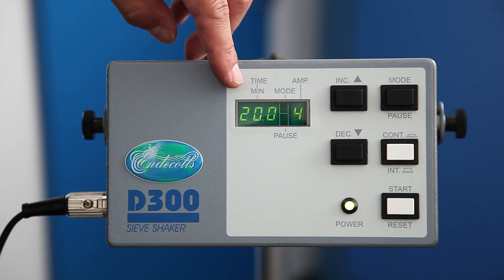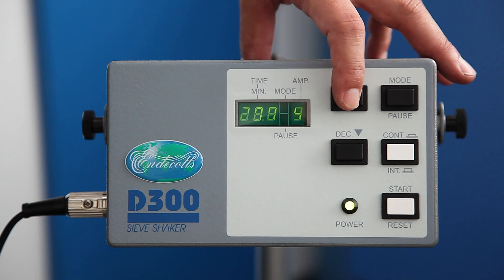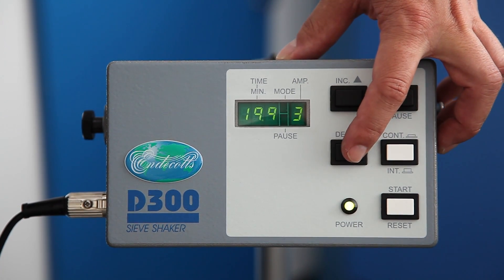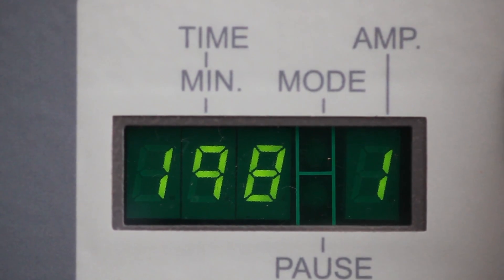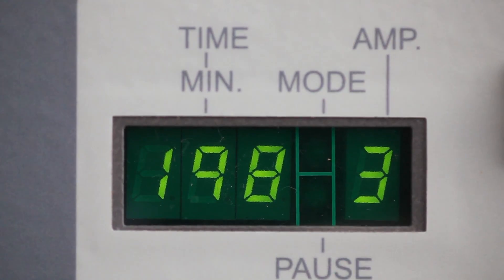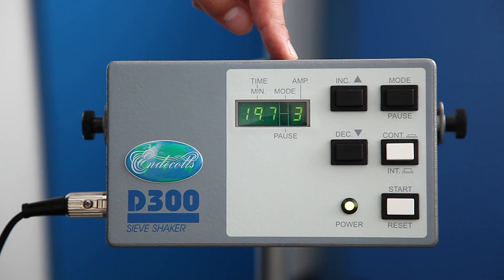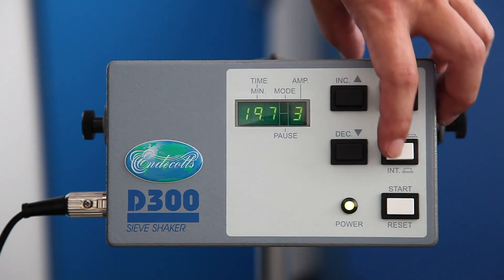Total time is of course adjustable, as is increasing and decreasing the amplitude. And again, as with the D450, there is a continuous and intermittent setting, with control over the time on and the time off.